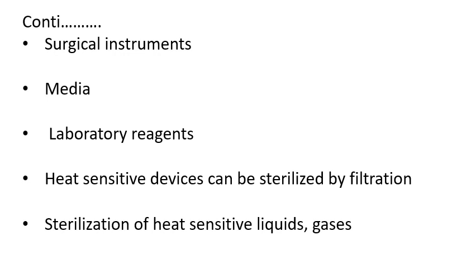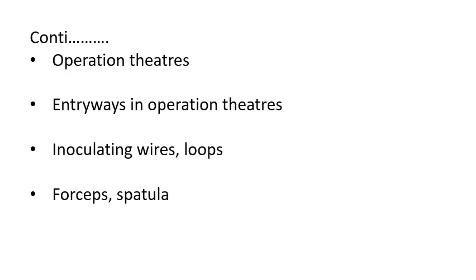Usually during the sterilization process we are giving heat treatment, either by dry heat treatment or moist heat treatment. So if you are using some of the liquids for the preparation of laboratory culture media, at that time those liquids, if they are heat sensitive, can be sterilized by using the filtration method. And heat sensitive liquids and gases also are sometimes sterilized by the filtration method.